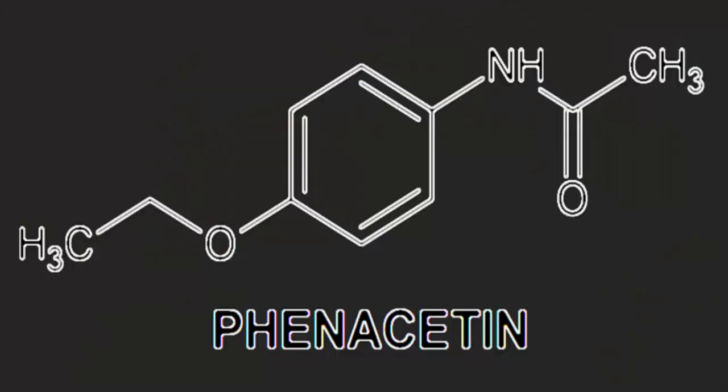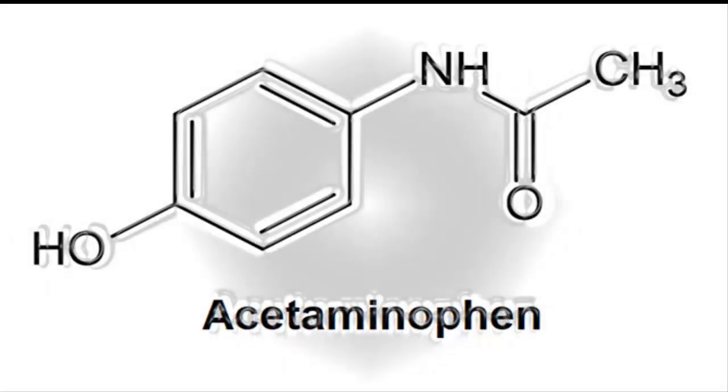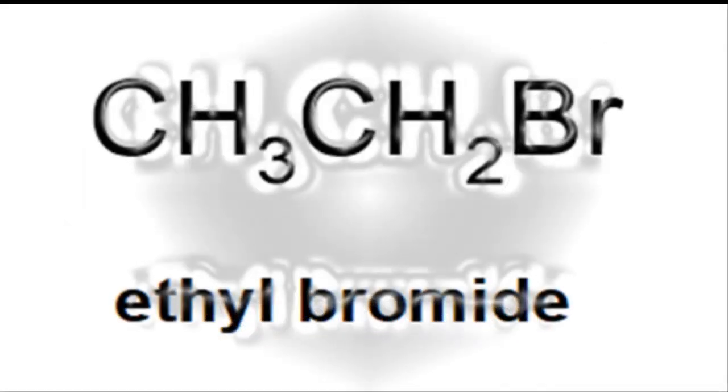In this video, we will synthesize phenacetin. To synthesize phenacetin we are going to need acetaminophen and ethyl bromide.